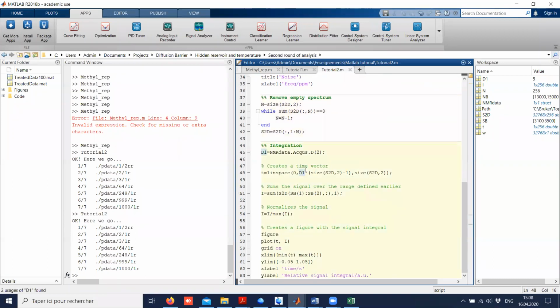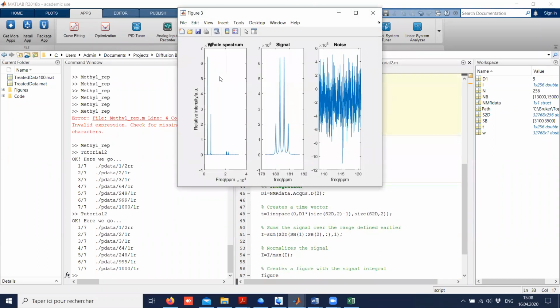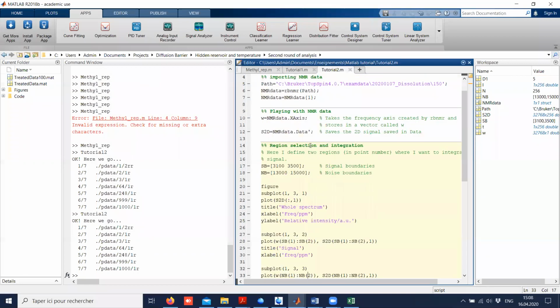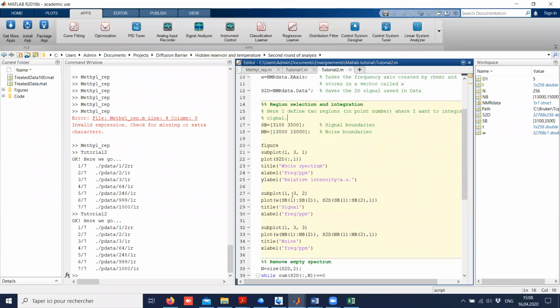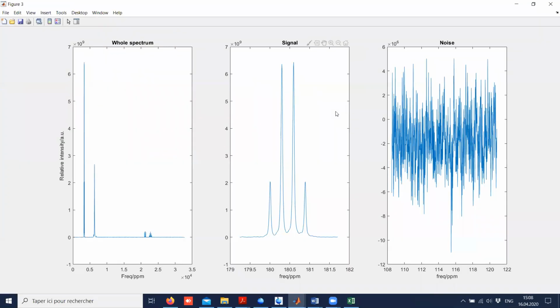And Quentin, yes, I have a question already. You were just showing us some spectra. Could you bring those up again, please? By the way, to do this, I click here, so now I'm in this bit of code, and to run only this section I press Control, Enter. Here they are. Wonderful.